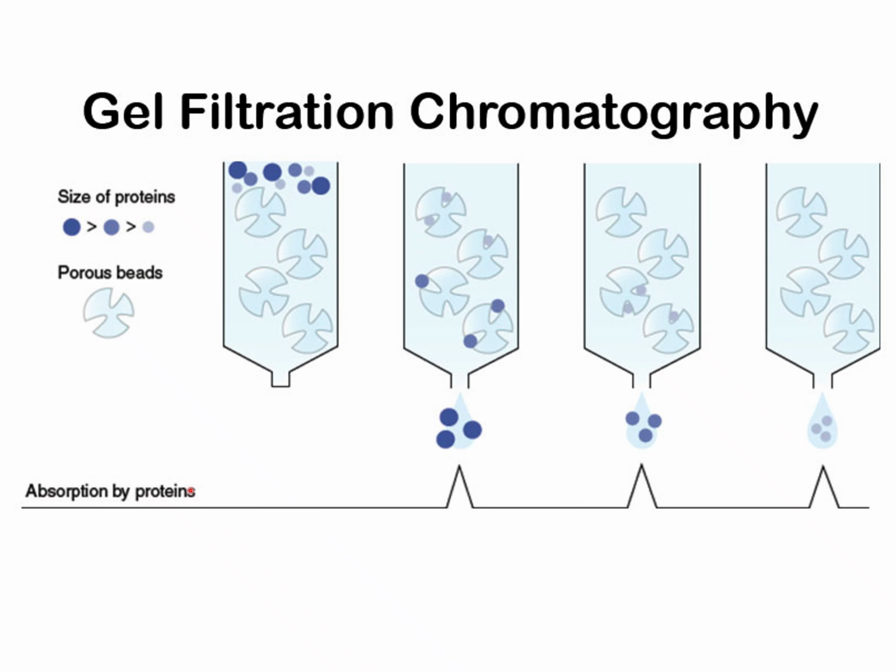So in the chromatogram, in the PC, we will just see the absorbance. We'll see the peak area or the peak. So you have to analyze your sample based on these peaks, because you will not see the molecule or the separation. You will only see the HPLC or GFC peaks. You have to analyze your sample, identify your sample, separate your sample, and quantify your sample based on the peak.